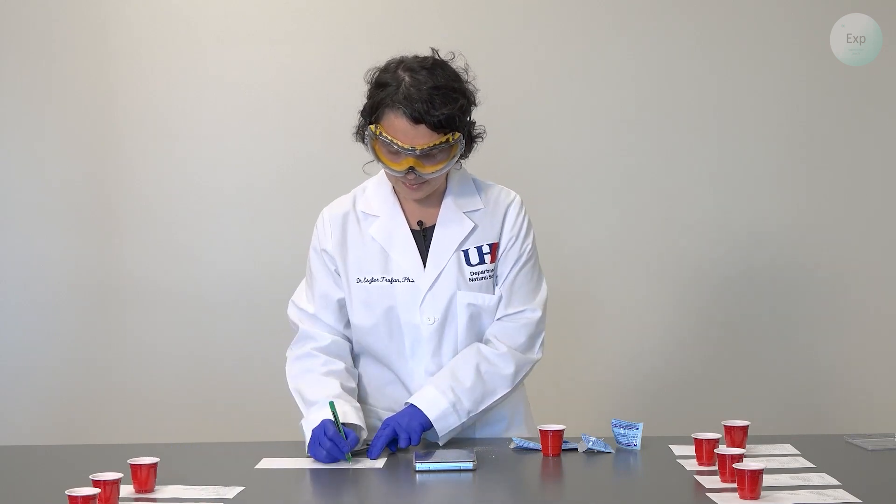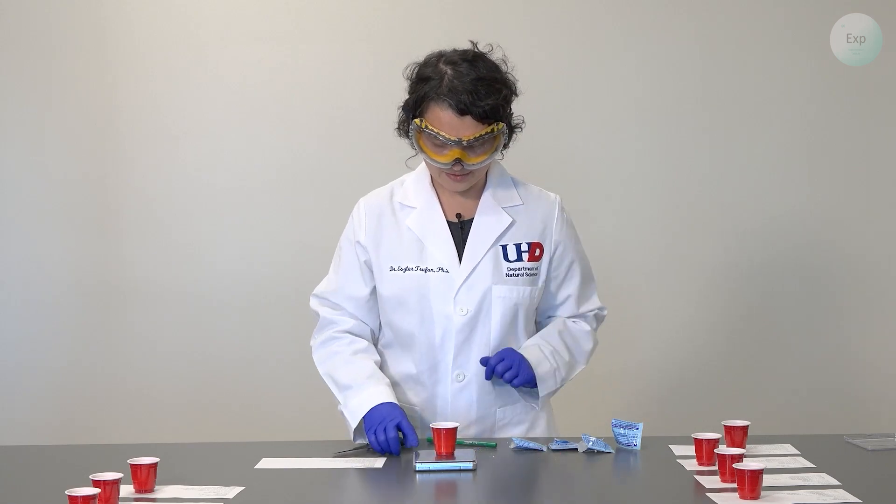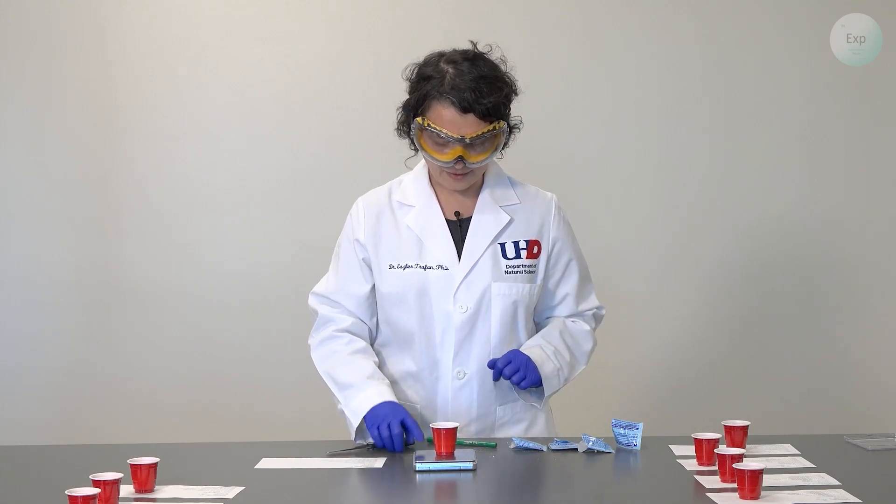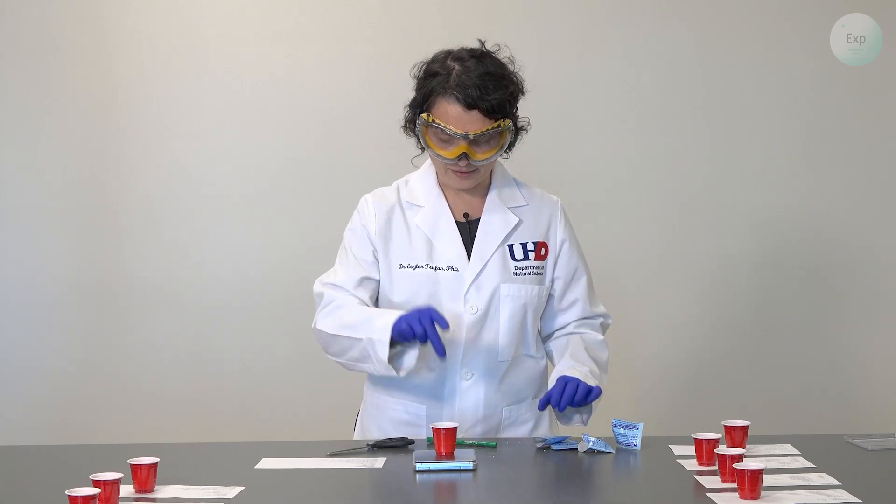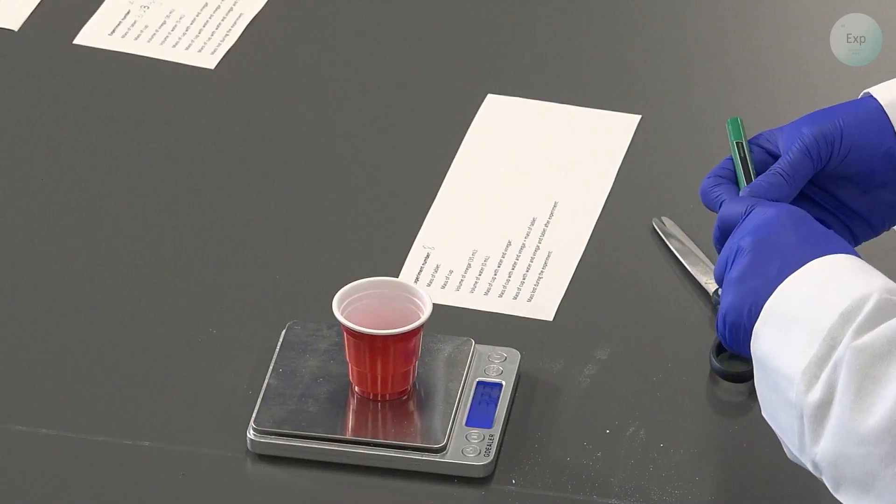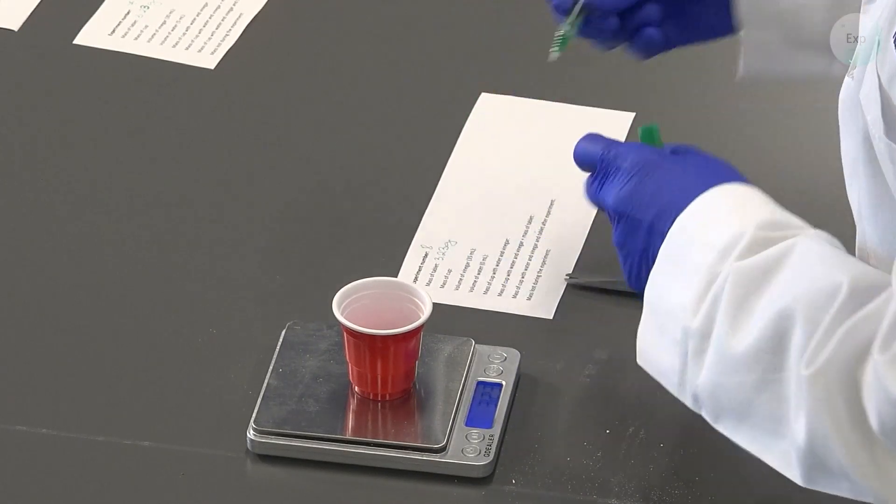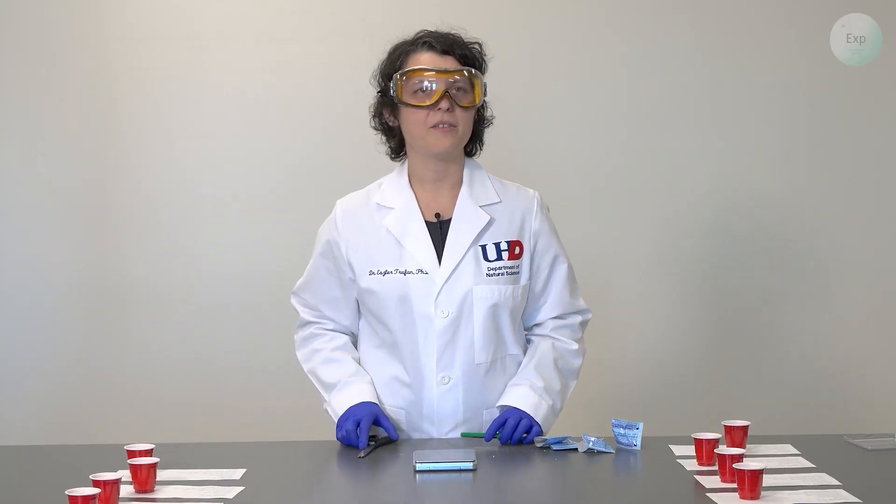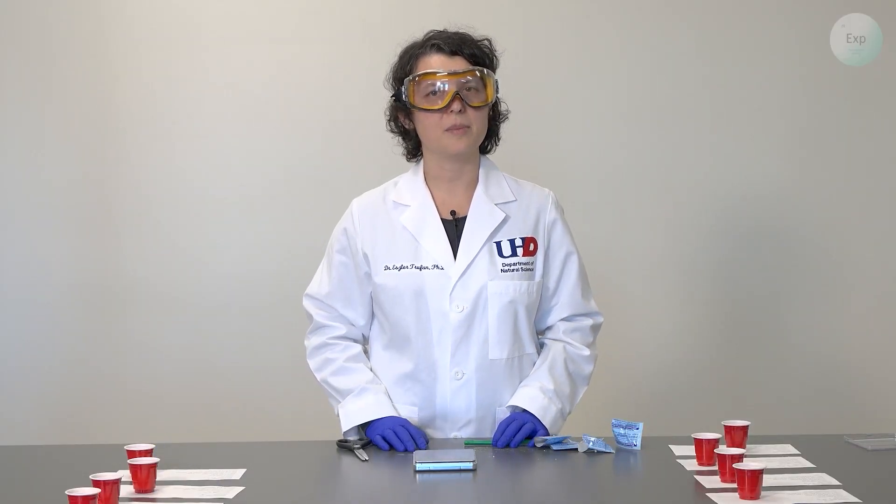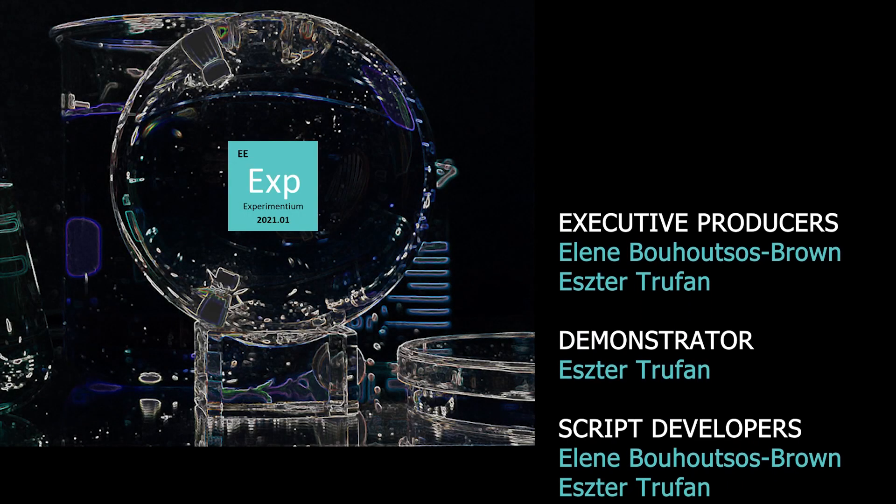For our final experiment, experiment number eight, we're going to place a cup on the scale, tare, and place our final tablet inside the cup. Its mass is 3.23 grams. With all our tablets prepared, we have the first set of measurements for our limiting reactant experiment.